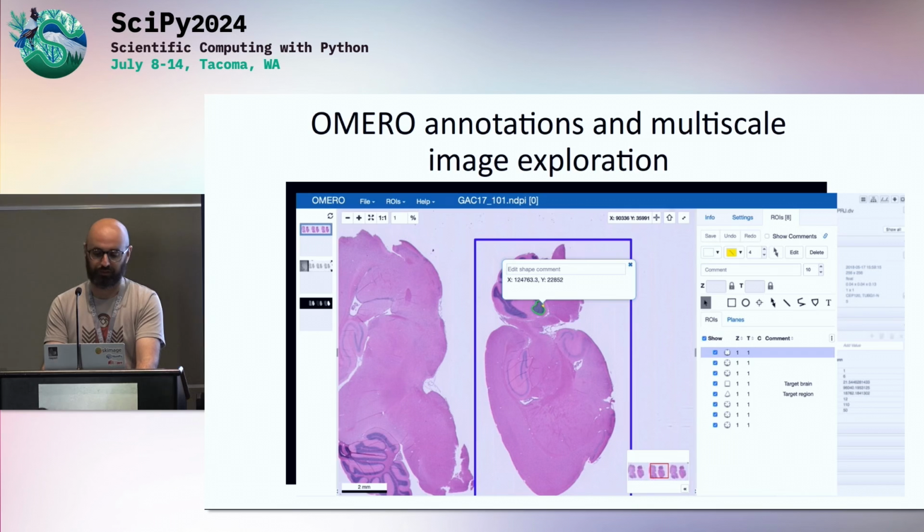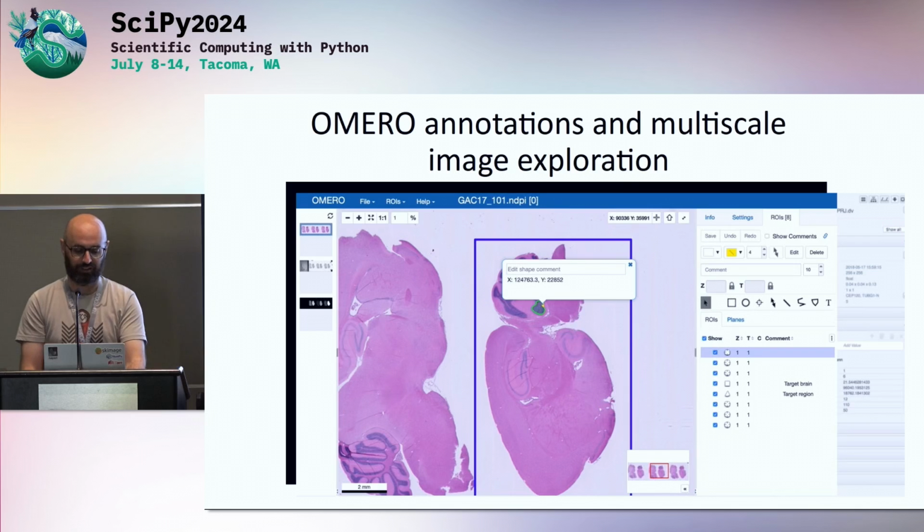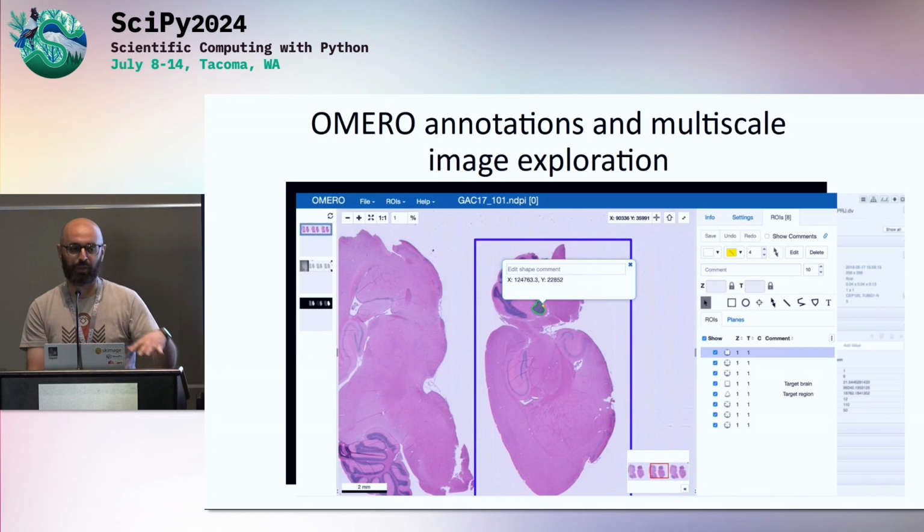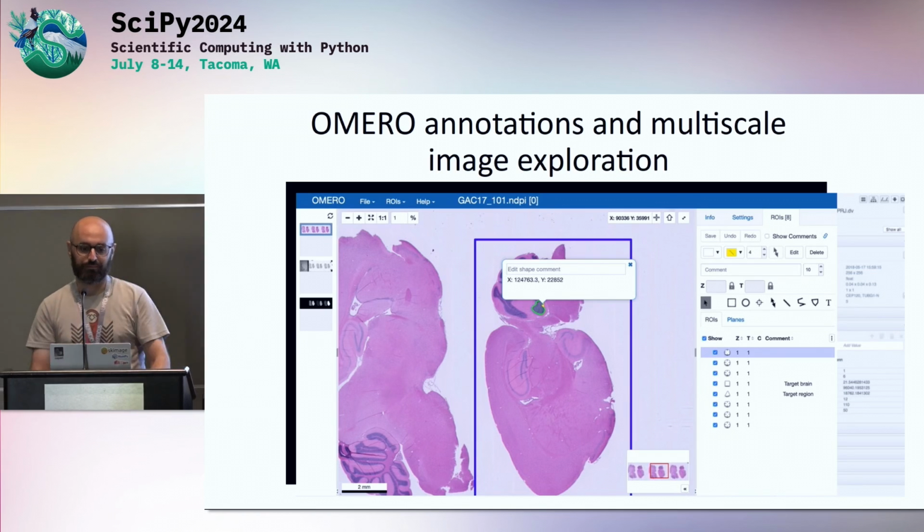It's super performant. It's very good. You can add, you can view, you can edit annotations. So in this case here, you probably saw people doing contours of cells, and there's this big box that tells you this is a chunk of tissue and stuff like that. Importantly, these annotations are stored in the database, not in the original data. So the original data, as ingested, is always immutable, read-only, you never touch it. You store everything else on top of it.